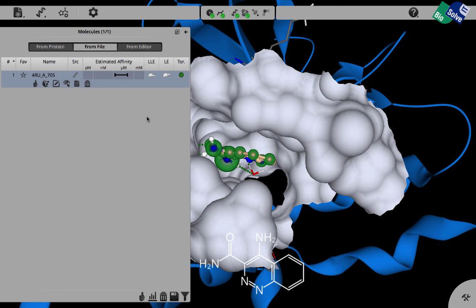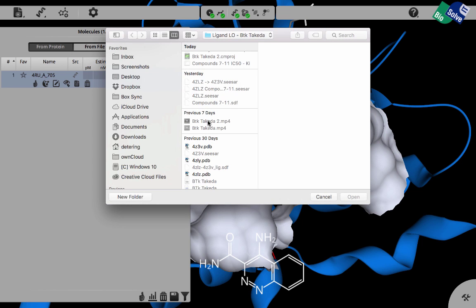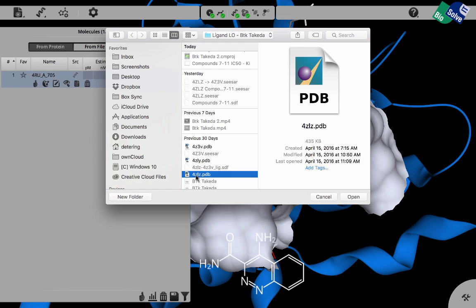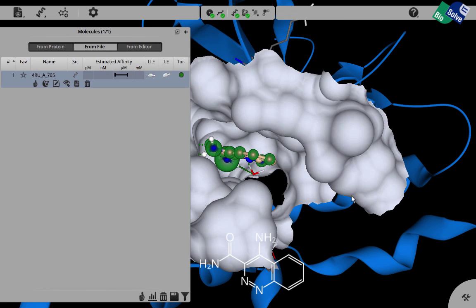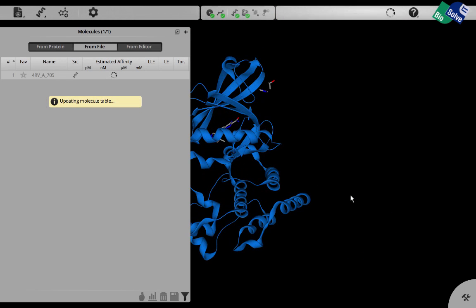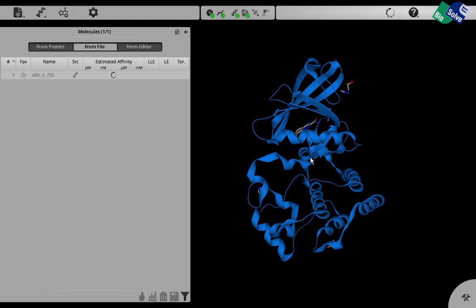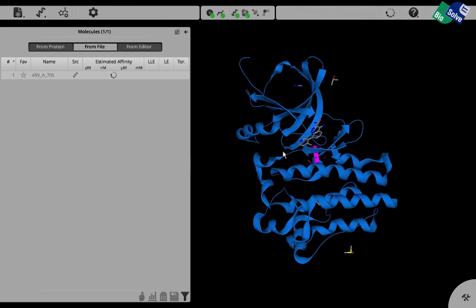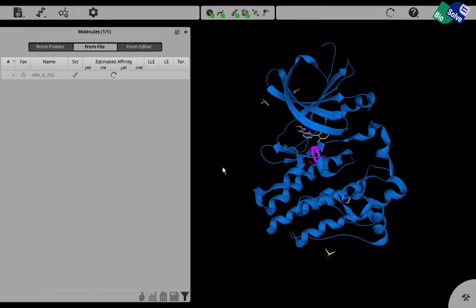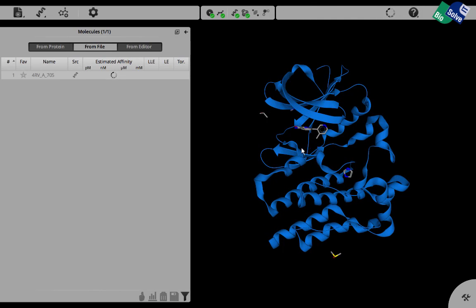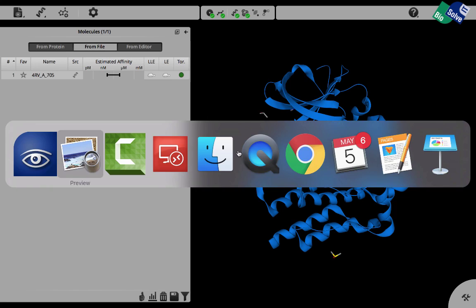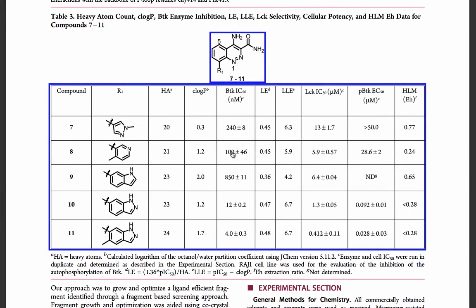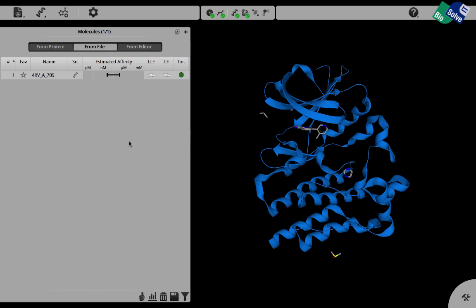In order to start modifying we load the compound number eight which was also co-crystallized. 4ZLZ is the PDB code. This is shown in its 3D structure. We can see the methylpyridine ring here. We can identify the p-loop. The estimated affinity is obviously a little bit better. If we remember the potency of this compound was around 100 nanomolar so that corresponds very nicely.